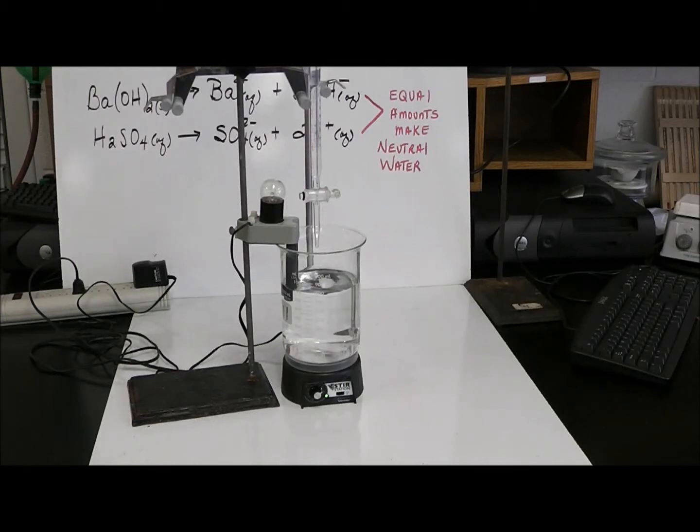So we are going to do a couple of concepts revolving around acid-base chemistry. A couple of things we're going to study in this demonstration are conductivity of solutions, acid-base chemistry, titration, endpoint determination. We're also going to look at the dissociation of ionic compounds, ionization, and precipitation reactions.